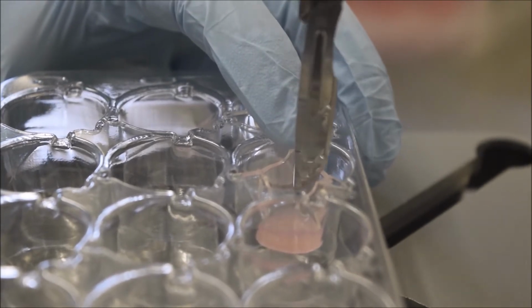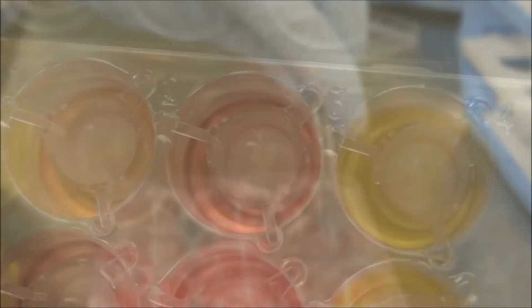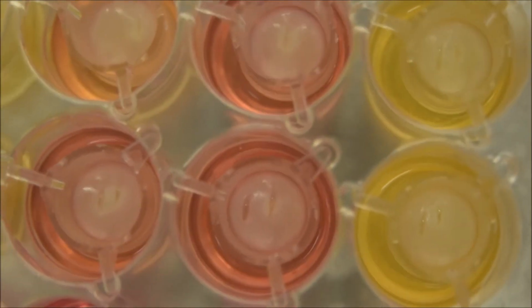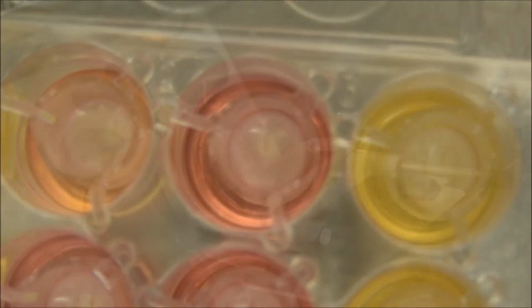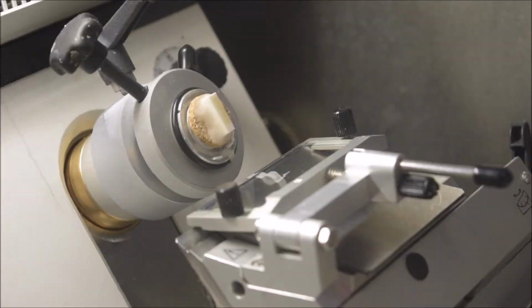Chronic wound models are made from wounding the skin with a sharp implement, and then bacteria is placed directly on top of the wound site. Infected samples are compared against non-infected samples to assess the molecular changes between the two wounds.